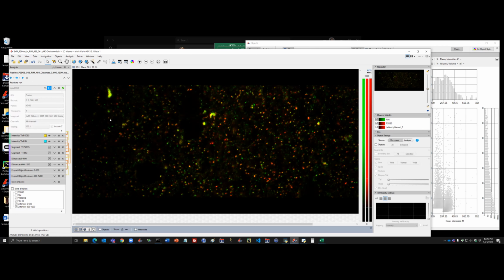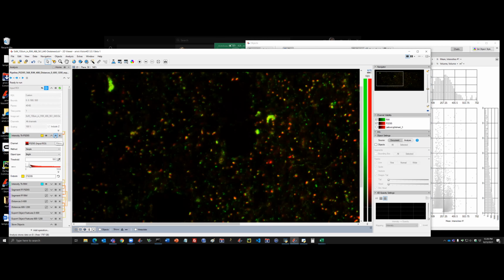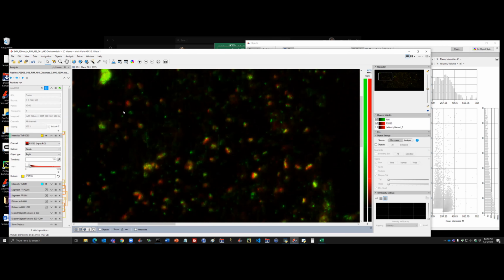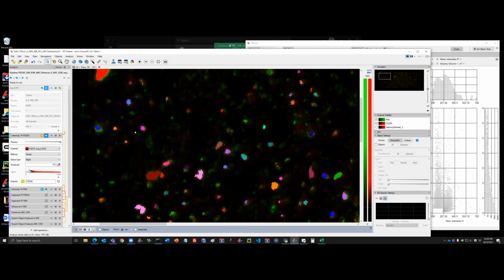So now we will be focusing on the smaller ROI in the left upper corner, and immediately we can go to the intensity threshold for the red particles here, and this is the preview button, which would visualize all the particles that would be identified with the given intensity threshold.